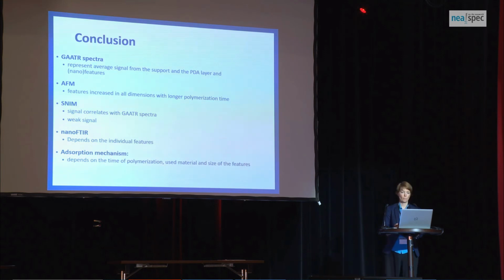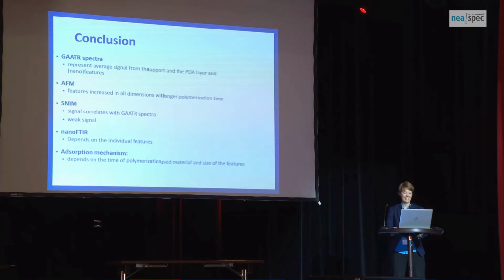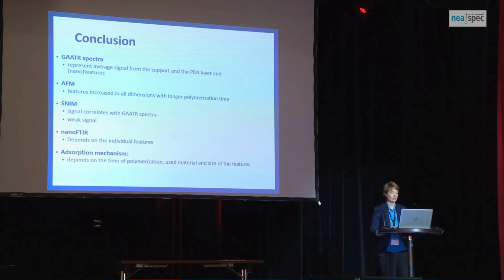Finally, let me summarize the results of our study I've presented here. Using grazing angle ATR, we obtained an average signal of all layers of the PDA. Using AFM, we obtained physical structures of the features on all substrates, and using scanning near-field infrared microscopy, we found the distribution of various intermediates of PDA on the surfaces. Nano-FTIR, we would like to use for characterizing various features and layers of the PDA at various times of polymerization on the substrates.